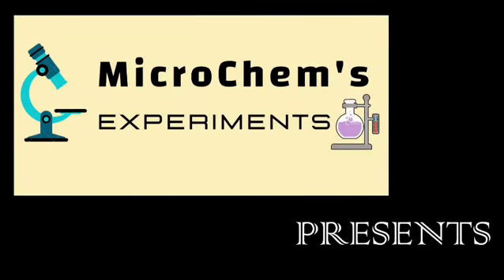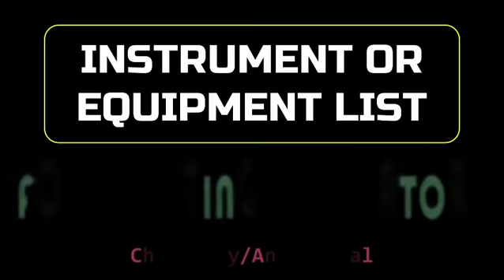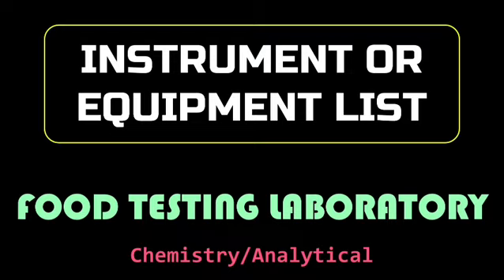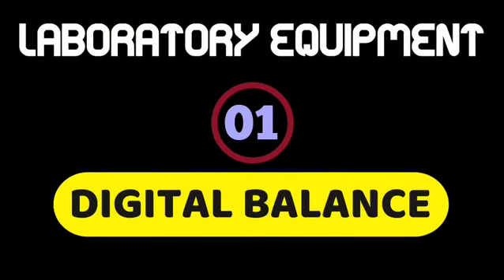Hi all, in this video we will be speaking about the most used equipment in a food laboratory, like weighing balance, protein analyzer, HPLC, burette, magnetic stirrer and so on. Hopefully you will gain knowledge about all the types, features and applications of all this equipment.